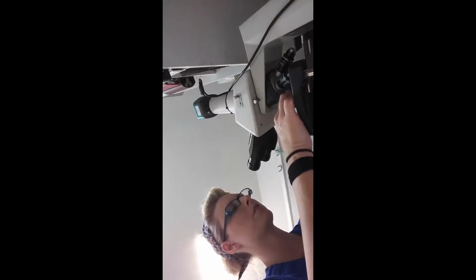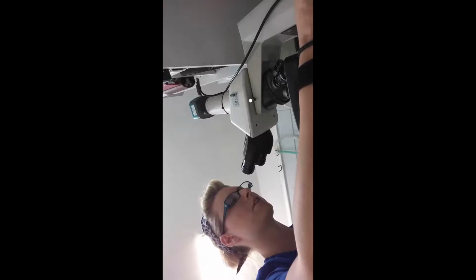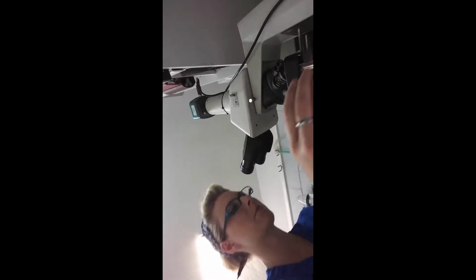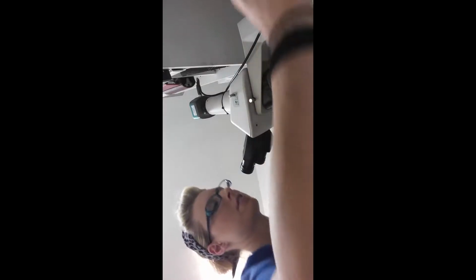Okay, now that the slide is dry, I'm going to go ahead and take a look. We're going to start with the 40. Let's see if we can find a grouping of cells. There we go. Let's see if I can find a good group of stain, which is right here. So what I'm going to do is take a little bit of oil and put a drop right in the center. I'll go ahead and take a look and see what you see.